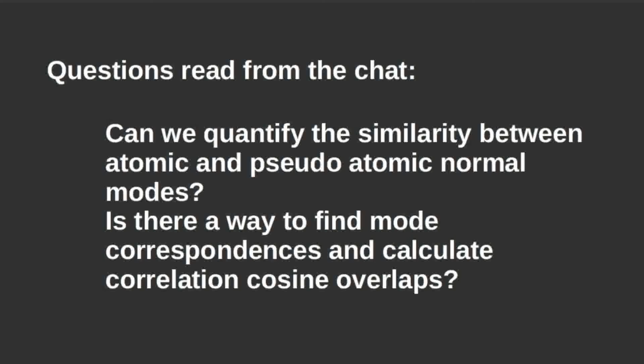I also saw a paper recently about this. How you can do the correspondence between the atoms and pseudoatoms, we didn't test, but maybe we will. I'm not speaking about modes, but about the correspondence between different atoms and pseudoatoms. But the correspondence between the modes, yes, you can overlap. All this has been done and published.